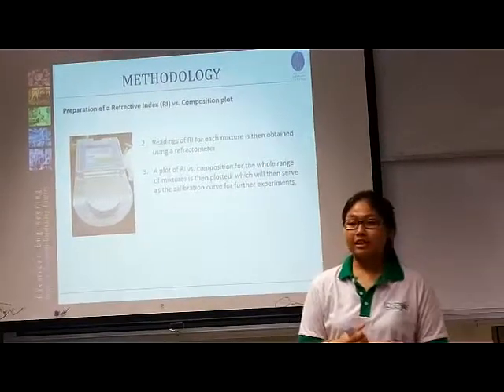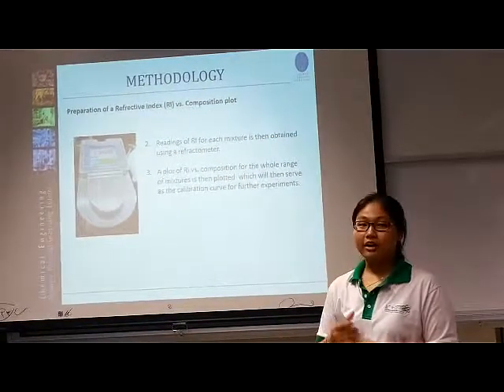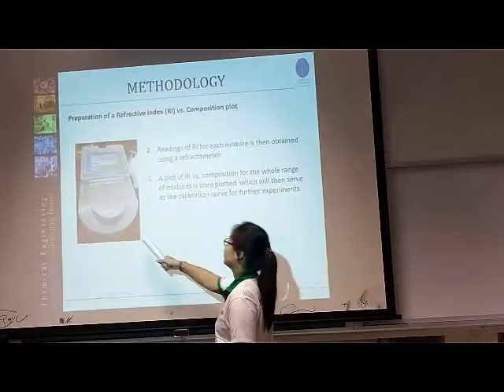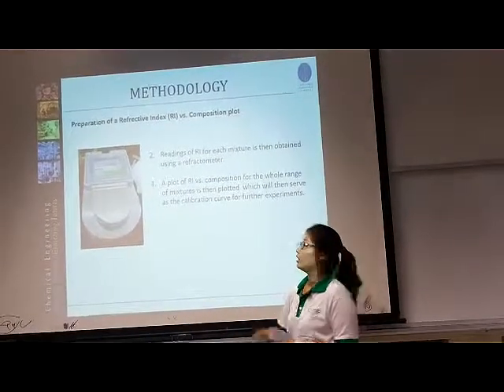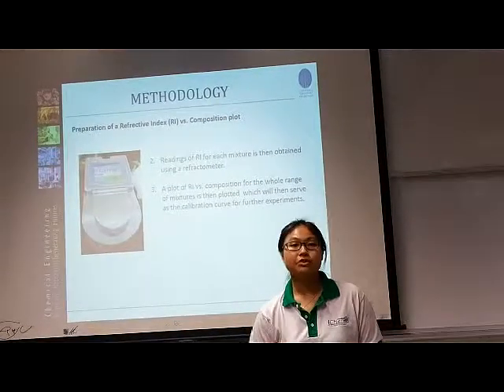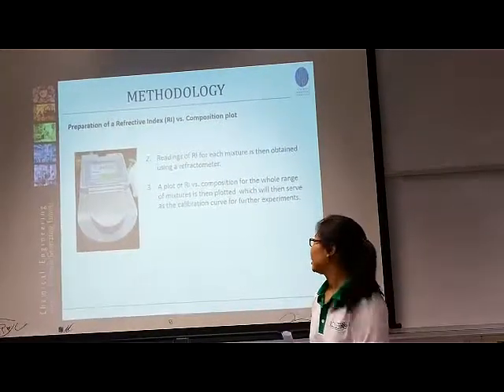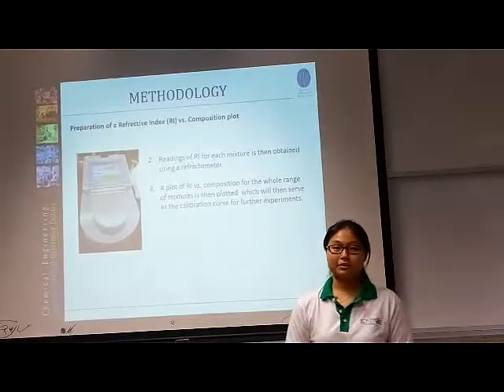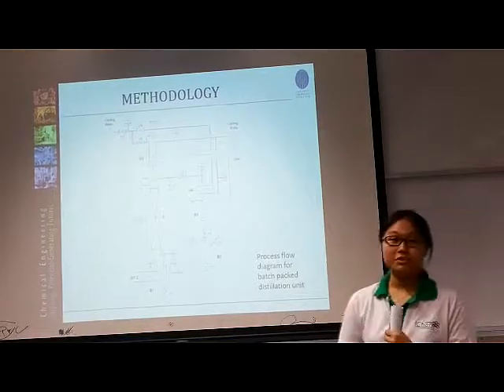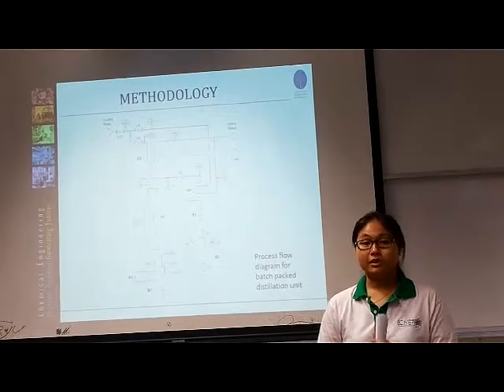Second, the readings of the RI of the mixture will be recorded using this refractometer. And then we can plot a graph of RI versus composition, which will then be used as a calibration curve for other experiments. Okay, we will proceed with the experiment.